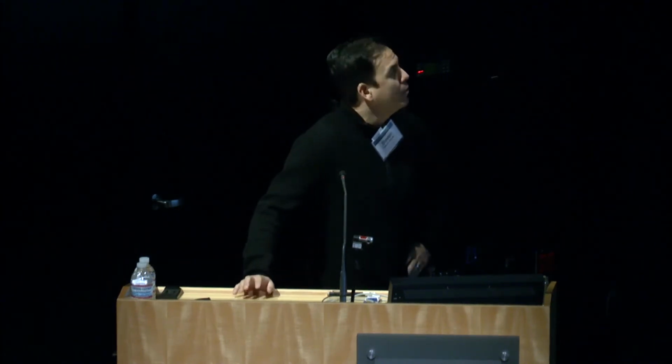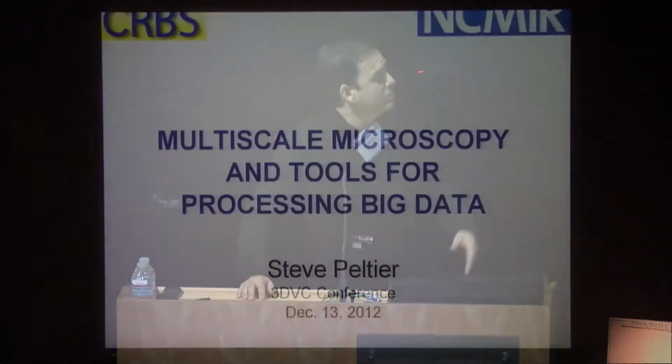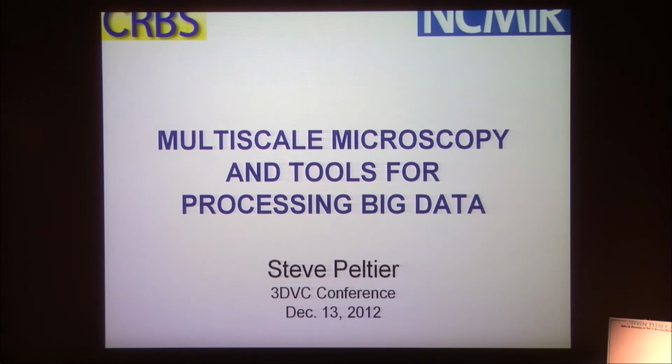And today, I'll be briefly talking about some activities related to multiscale microscopy, and in particular, some of the tools that we're developing for processing some of the big microscopy data that we're now producing, and how these might be leveraged for this 3D virtual cell activity.